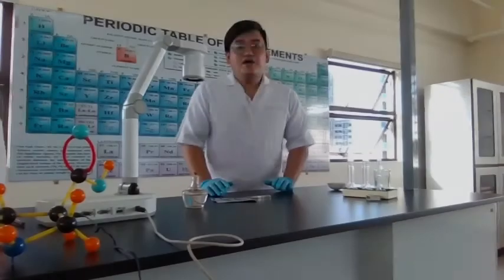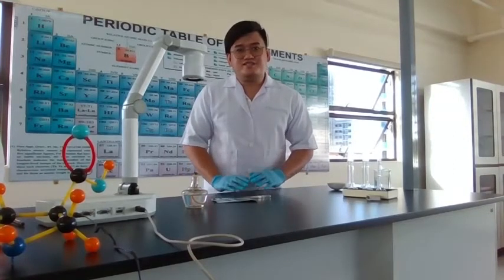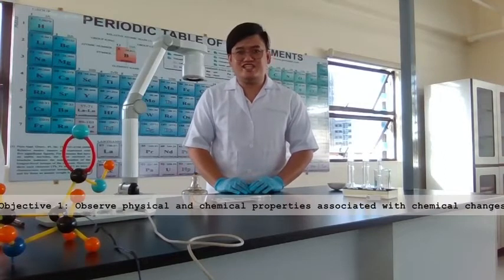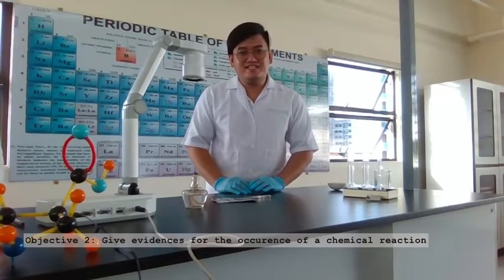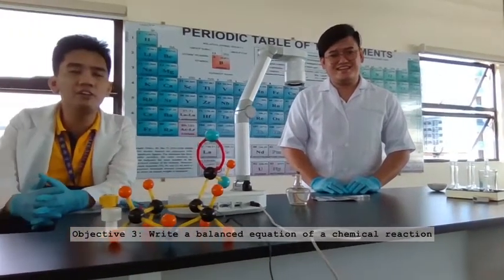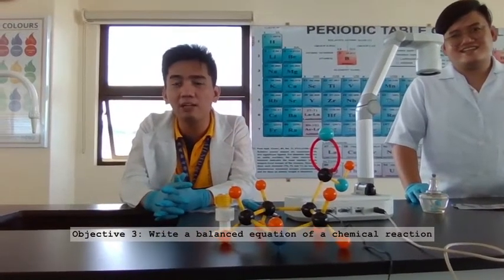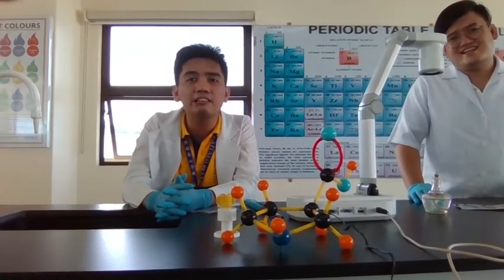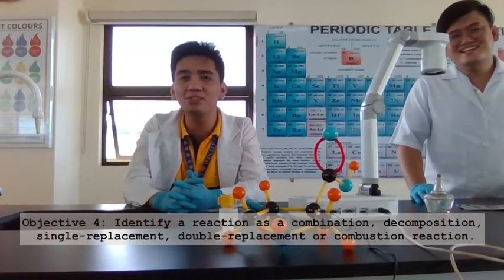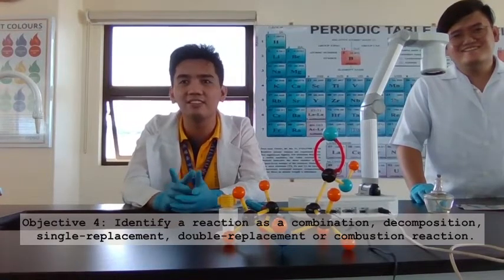There you go. Through this demonstration and within the discussion, you will be able to observe physical and chemical properties associated with chemical changes. You'll be able to give evidences for the occurrence of a chemical reaction. Furthermore, you will be able to write a balanced equation for a chemical reaction. And lastly, you will be able to identify a reaction as a combination, decomposition, single replacement, double replacement, or combustion reaction.